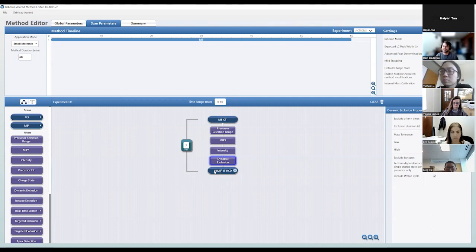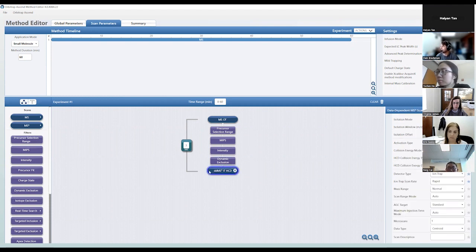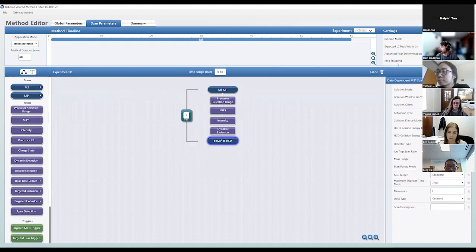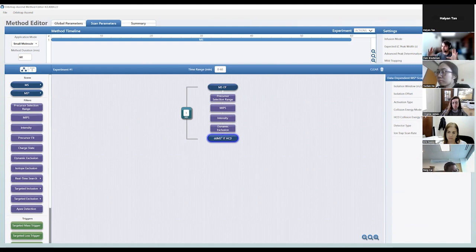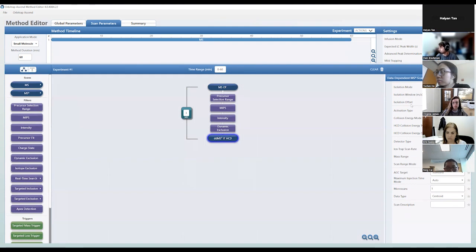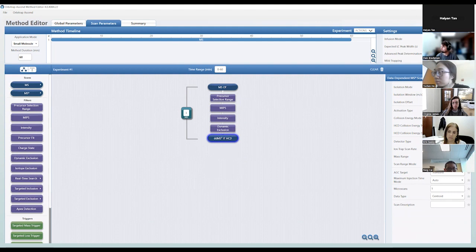Now we get to the MS2 node itself. For ion trap analysis, we isolate precursors with the quadrupole — it's faster than isolating with the ion trap. You can use different isolation windows; the Orbitrap Ascend goes down to about 0.4 Daltons at the narrowest, or you can go wider. The narrower your isolation window, the less co-isolation of isobaric species, but it comes at a cost of sensitivity. I typically use an isolation window of 0.7 m/z, though I've also seen people use 1.0 — there are small differences in total IDs and co-isolation amount.